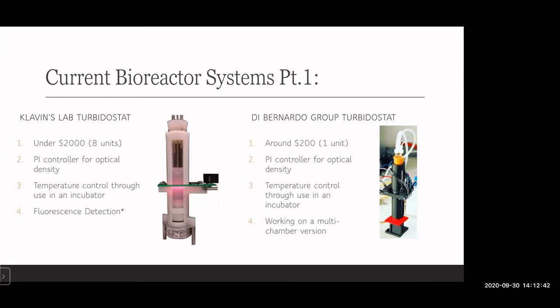And you would see, if any of you have been inside of a biolab, that an incubator is essentially an enclosed environment that controls things such as temperature, humidity, and gases within the chamber itself to allow for optimal growth conditions.